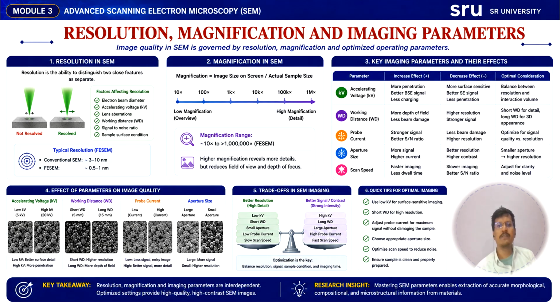SEM instruments can provide magnification ranging from a few times to several hundred thousand times. Advanced FESEM systems can exceed 1 million times magnification.